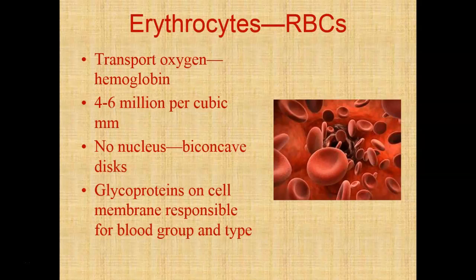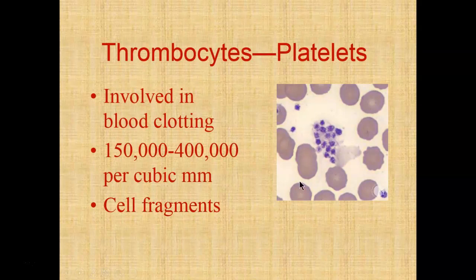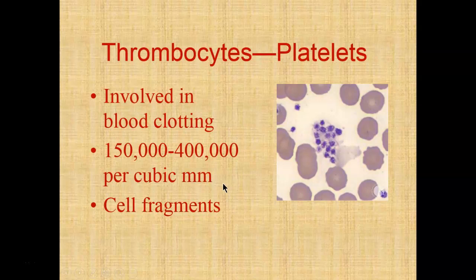Your thrombocytes are your platelets. You can see the tiny purple spots in the image. They fragment off a large megakaryocyte — a great big monster cell that just breaks apart, and those fragments become your platelets. They're involved in the blood clotting process. There are normally 150,000 to 400,000 platelets per microliter in a blood sample.